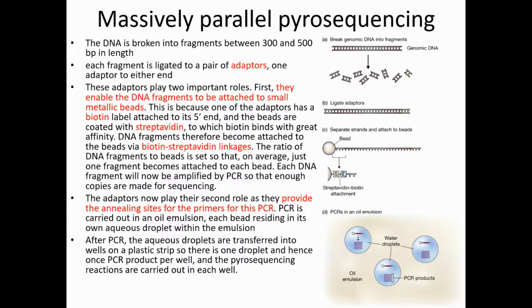So the adapter helps the fragment attach to the bead, and the adapter can also serve as the annealing site for the primer, and then they can start the synthesis in the PCR reaction.